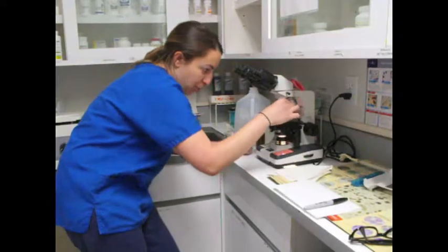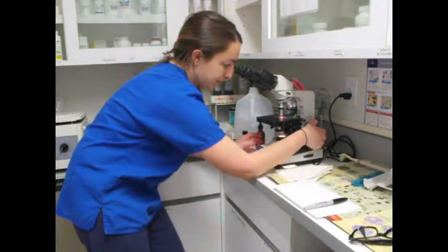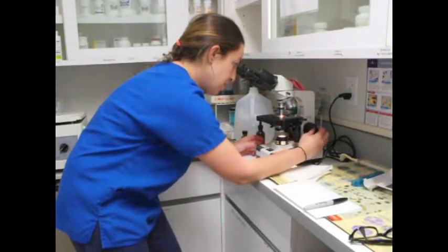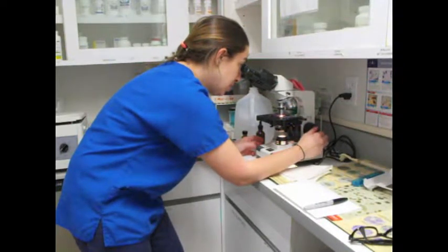So I'm going to now place it on the 100x magnification, or the oil immersion lens. And this is where I'm going to perform my differential count. So you want to refocus it. I want to make sure you're on the proper setting.